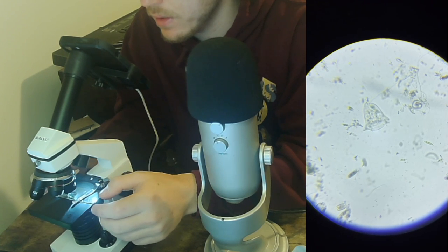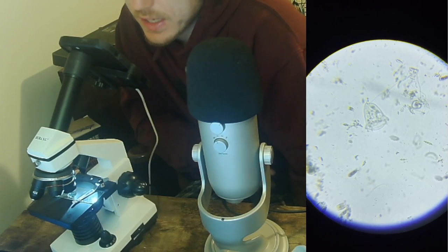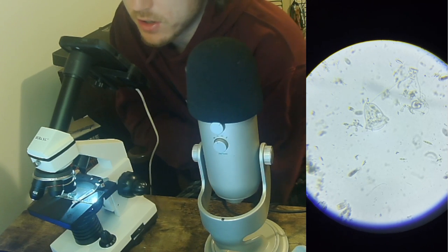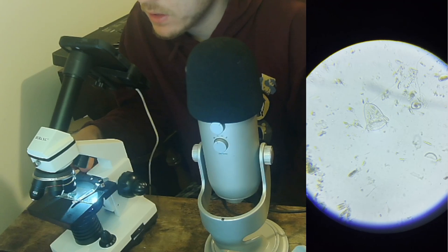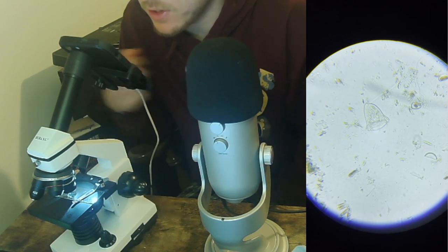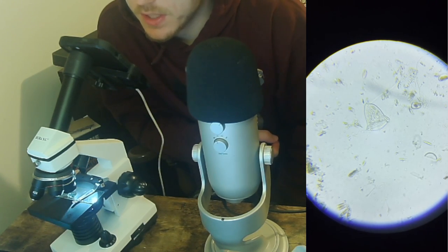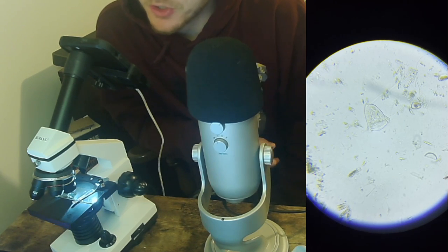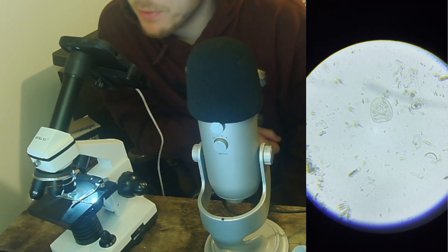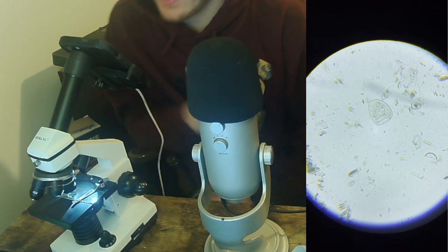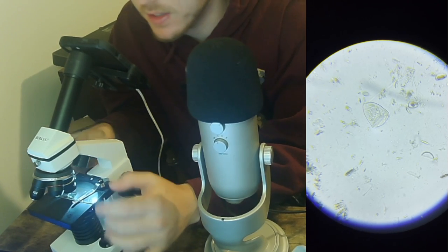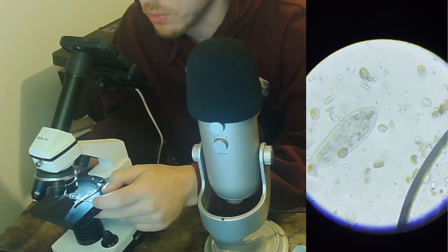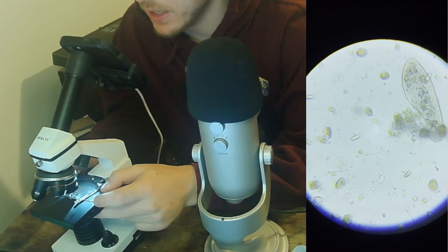Oh look at that! I wonder if that's the vorticella again. It does look like he has that stalk. Is this what they look like up close? It certainly has that shape and that stalk. Very interesting. You can see the way he's sort of moving the particles in front of him, sort of like a filter feeder. Oh yep, that's definitely what he is. You see as he snaps back, closes his mouth. I wonder if something touches him the wrong way, he gets scared and then snaps himself back.